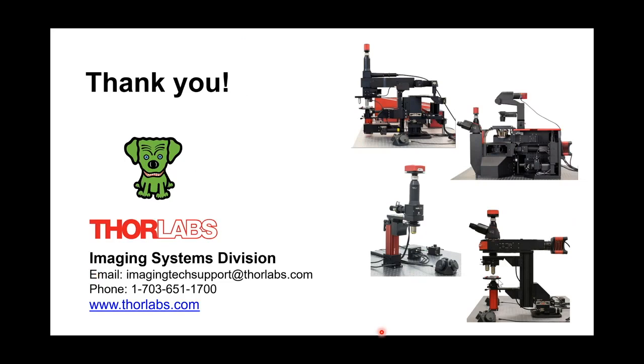And we'll go to the very big one first. Can I use the same optics to do confocal and multiphoton imaging? What are the differences that I need to take into account in the detection of the confocal versus multiphoton signals?